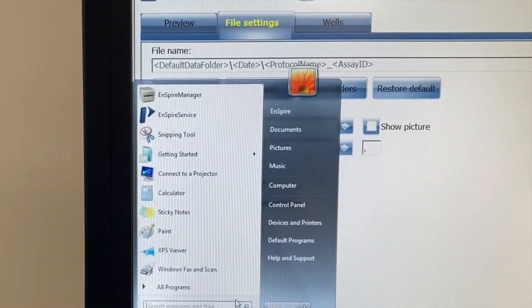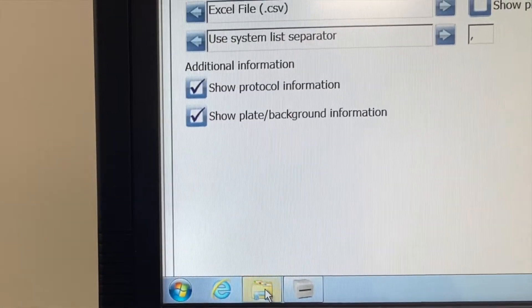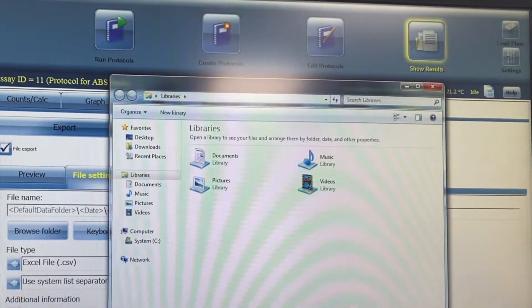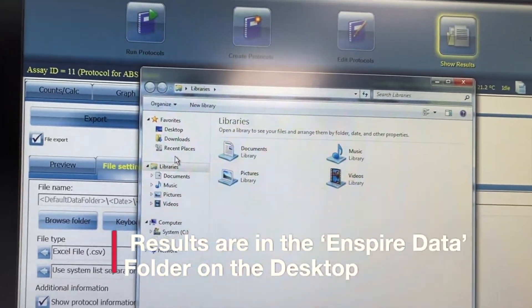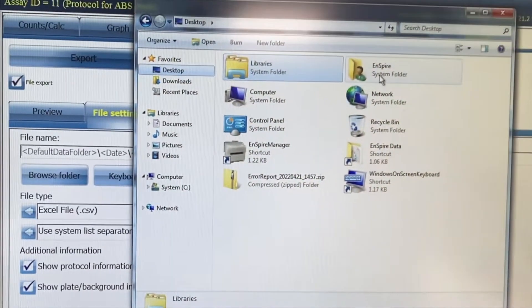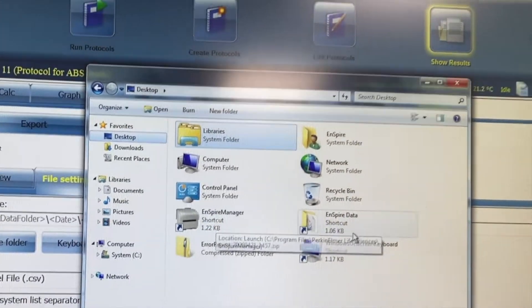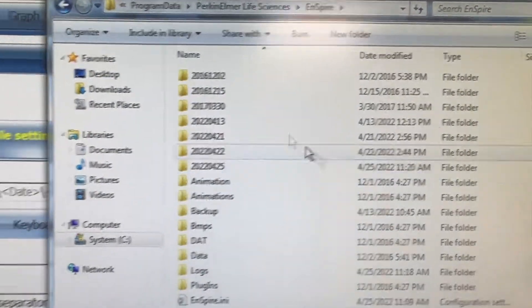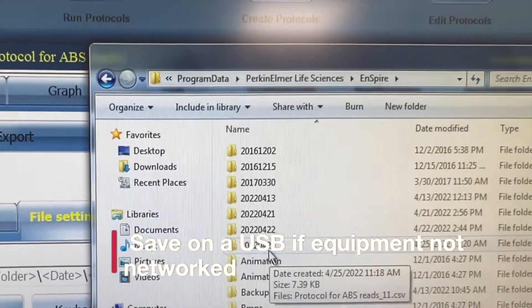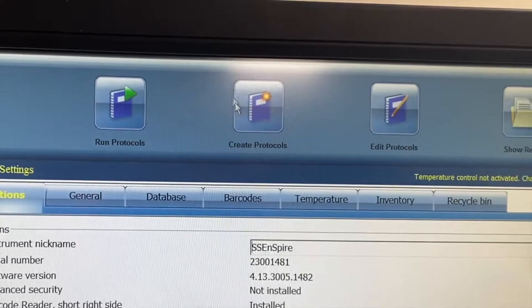To actually access your file to copy to a USB — if you're not networked — press the Windows key. Once you press the Windows key it will show you additional icons that weren't visible before. Press the file folder, go to Desktop where the Inspire folder is, then Inspire Manager, then Inspire Data. It creates a folder with the date, so open the folder for today's date, access that file, copy it, and with your USB plugged in you can put your file onto it.